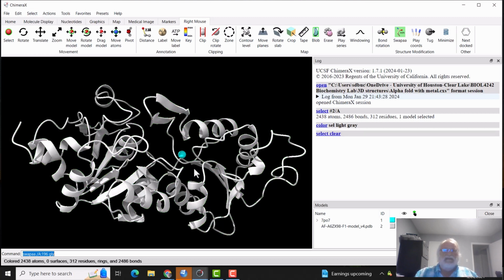So now we have this gray protein structure in the cartoon form. When you see these little arrows for beta sheets and helices like this for alpha helices, this is referred to as a cartoon version. There are space filling models like that you may have seen in lecture class, but here it is.